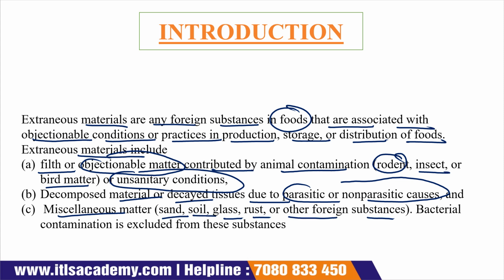But there is one exception here: bacterial contamination is excluded from these substances. It means that we are not considering bacterial contamination as extraneous matter or material, okay.